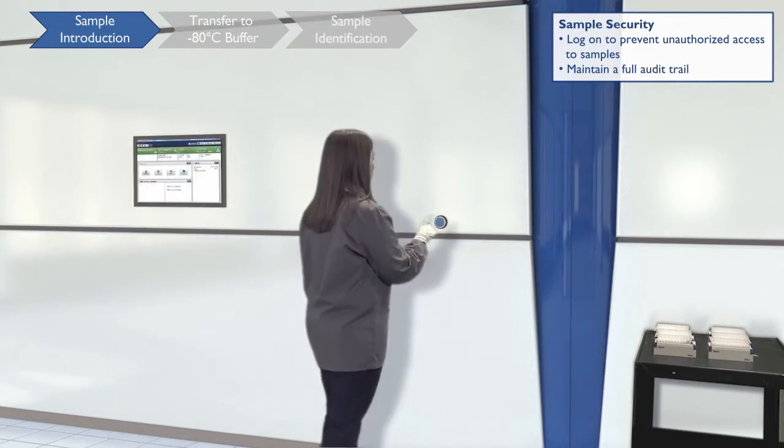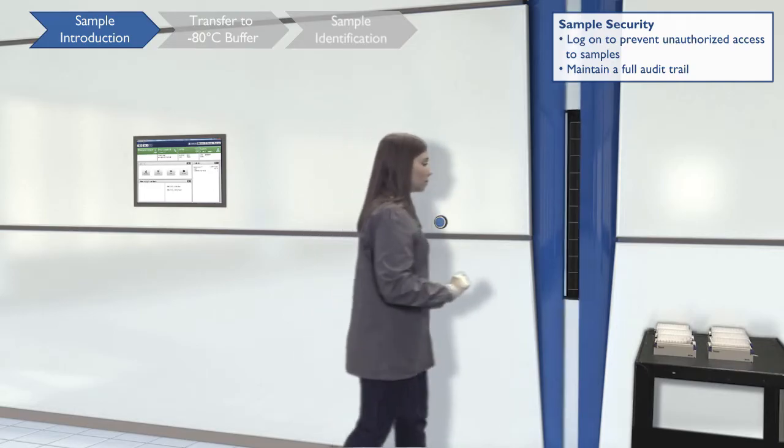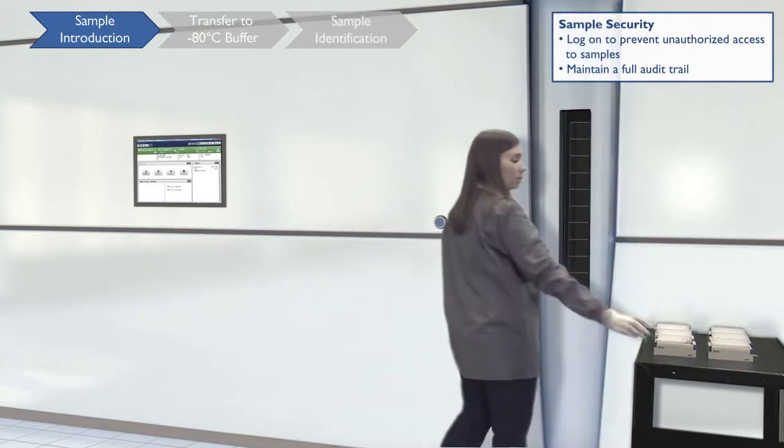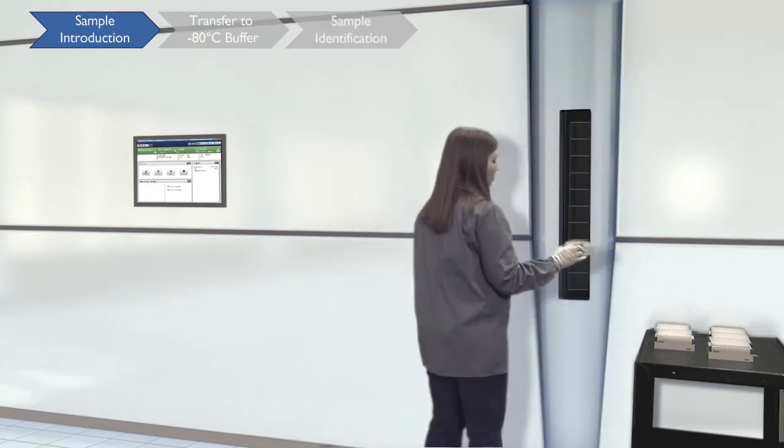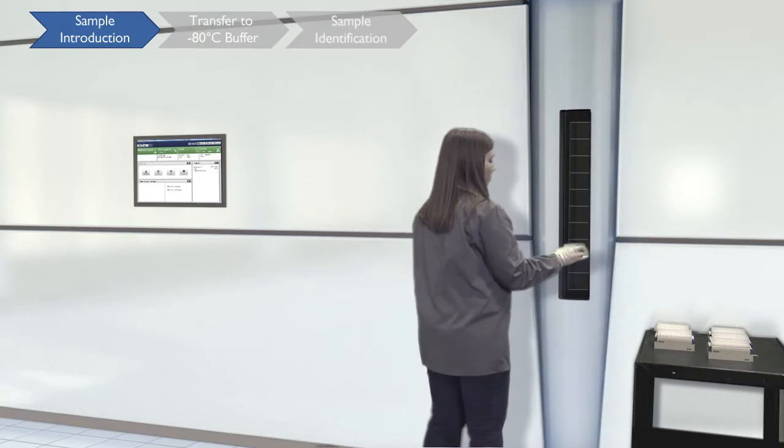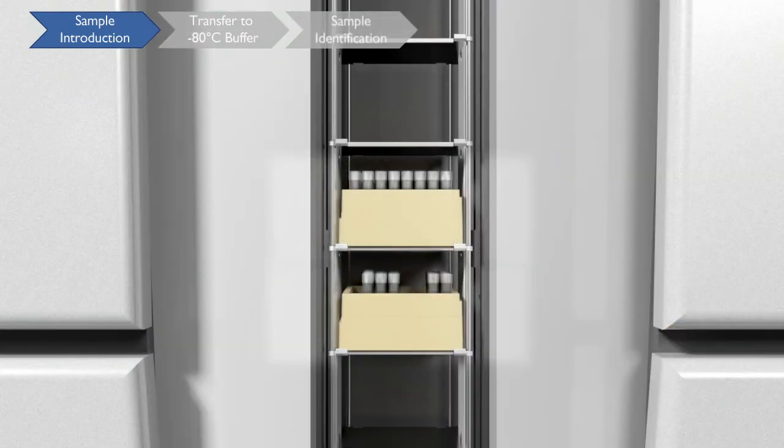To load samples, simply push the button. The door will open and you place your samples on the shelves provided. BIOS starts processing your samples once you push the button again.